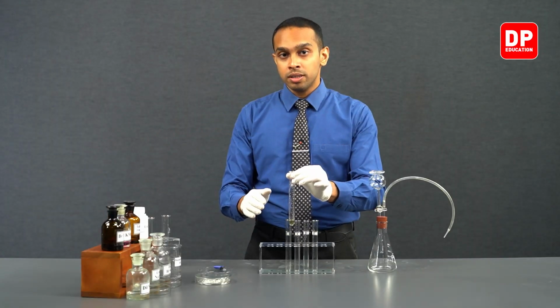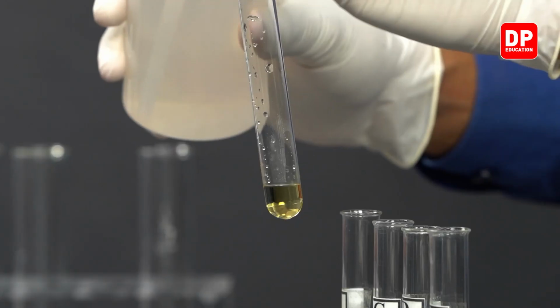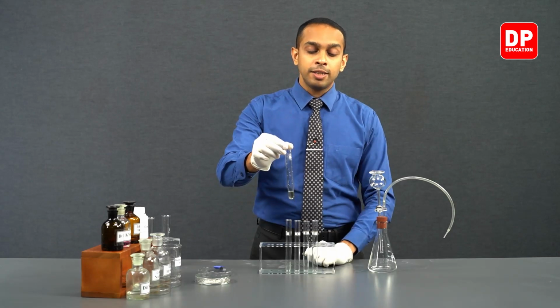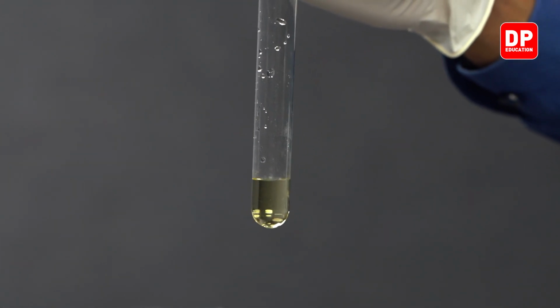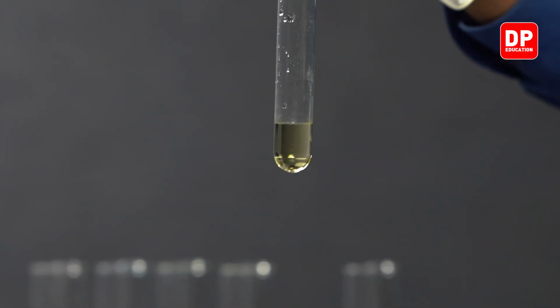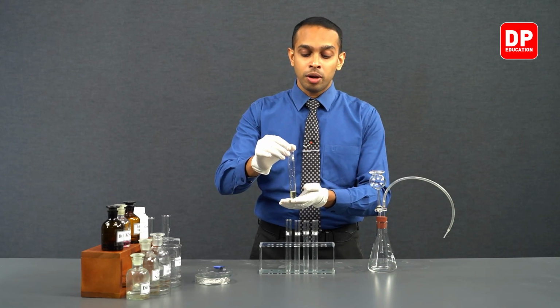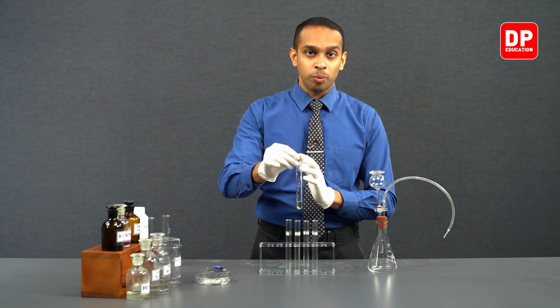If the bromine water is too concentrated, you can further dilute it a little bit, because we have to take a dilute solution of bromine water. As you can see, students, bromine water has this yellow color. This is a dilute sample of bromine water, so the color is not as dark as it usually is. However, you can observe a yellow color present here in our bromine water.